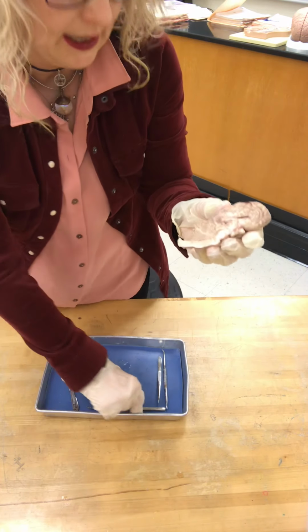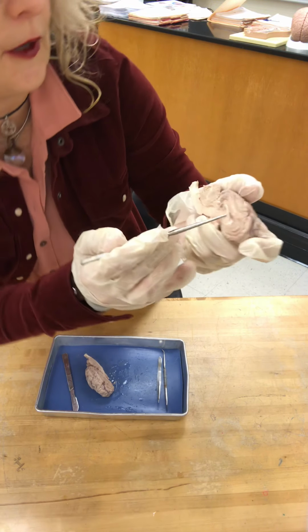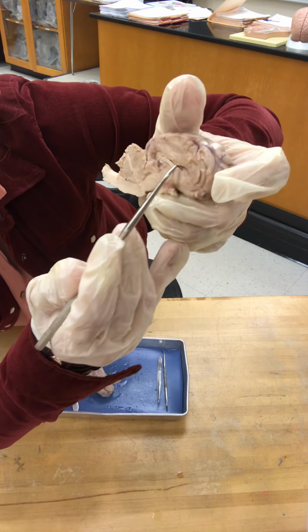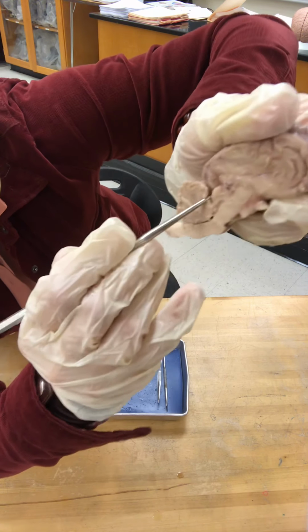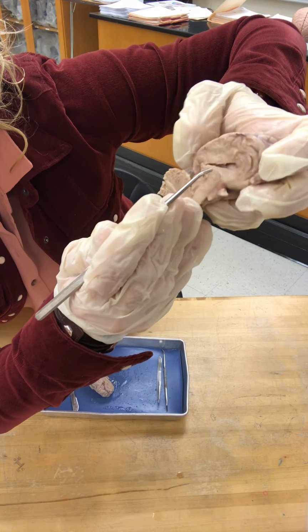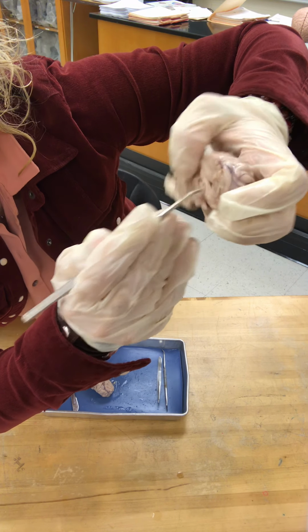And what I'm going to do now is show you all the parts. So first things first, what you're going to see over here, that would be the corpus callosum, third ventricle, fourth ventricle here. What else? Beyond the corpus callosum, you're going to want to take a look and find the hypothalamus.